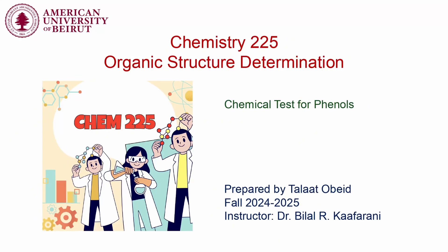In this video, I'll be showcasing the ferric chloride pyridine reaction, highlighting the presence of a phenol in an unknown compound. To start off, I'll be preparing my positive control.